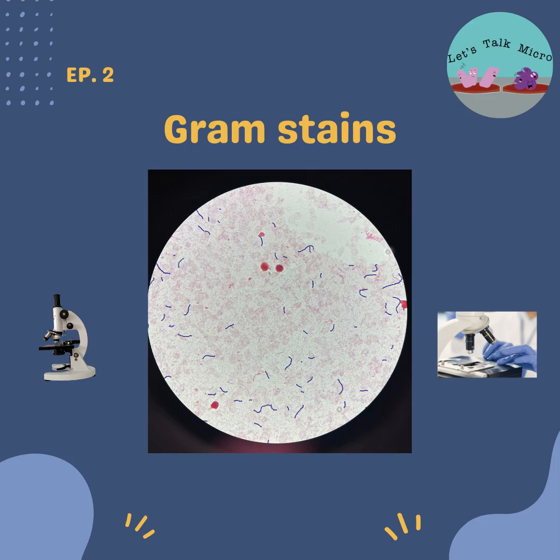My advice to you new techs is that before you get to the automatic stainers, work on your technique. This is all about repetition. I keep saying it: repetition, repetition, repetition. You don't become a microbiologist overnight. It takes years of practice, years of doing the same thing over and over again. So make sure that you get a good handle on your technique before you start using automated stainers.